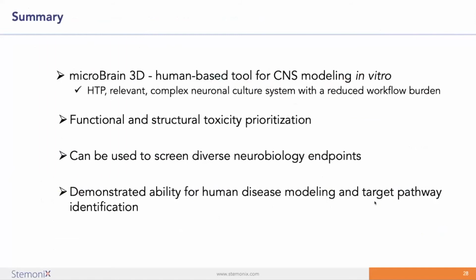They can be used in functional and structural toxicity prioritization, can be used to screen across a diverse number of neurobiological endpoints, and last but definitely not least, can be used to generate diseases in a dish and then screening to find potential therapeutic compounds and pathways.